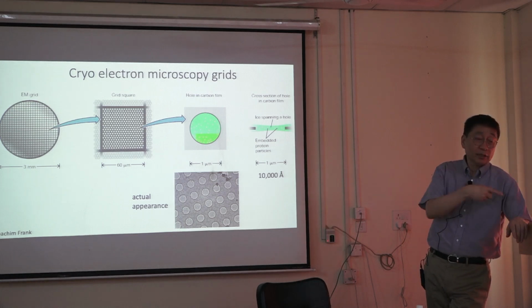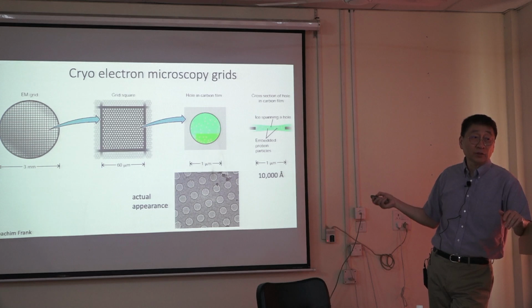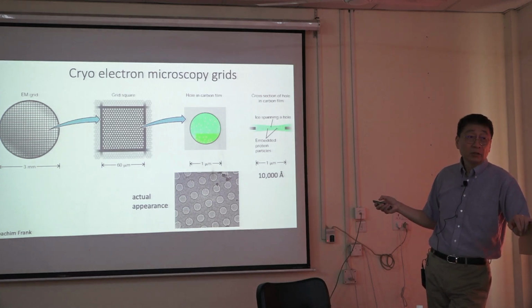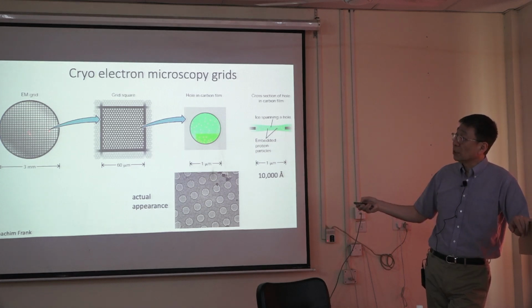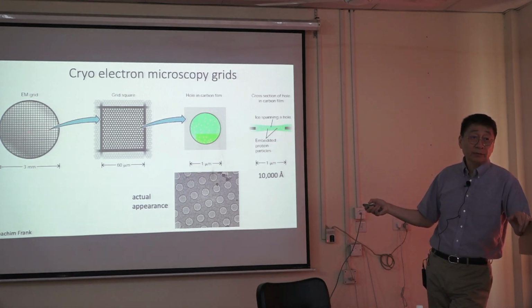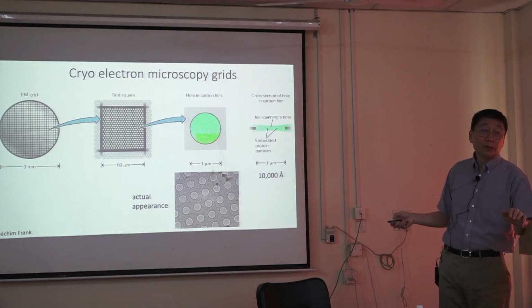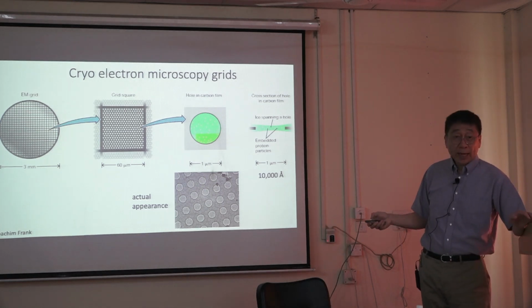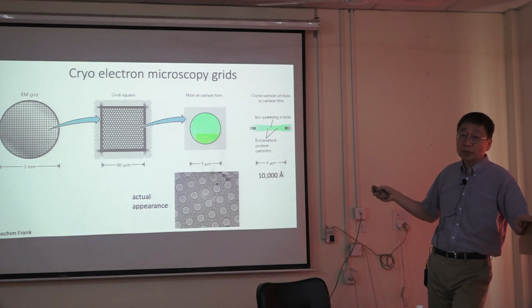Hands-on. I guess we just did some hands-on now, which seemed to work. So I'll show you hands-on how to solve a structure using cryo-EM, going through the process of cryo-EM. But this is sort of the beginning stage. Before this, of course, is protein expression and purification, which we've covered already. Once you have that, you come here. So with that, we'll stop for lunch, and then we'll continue with this after lunch.